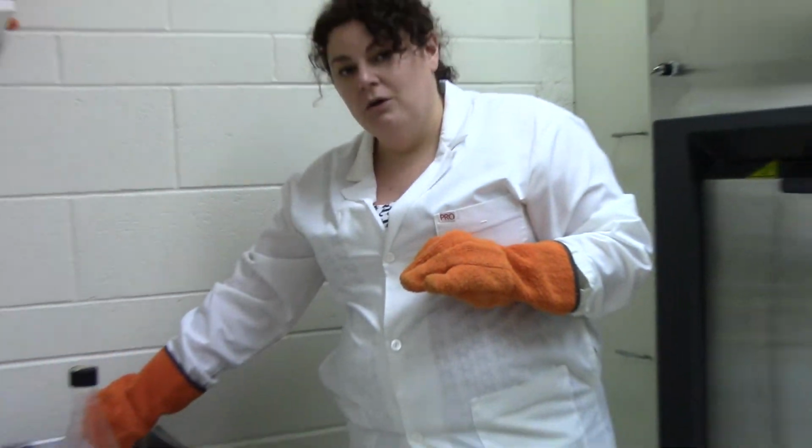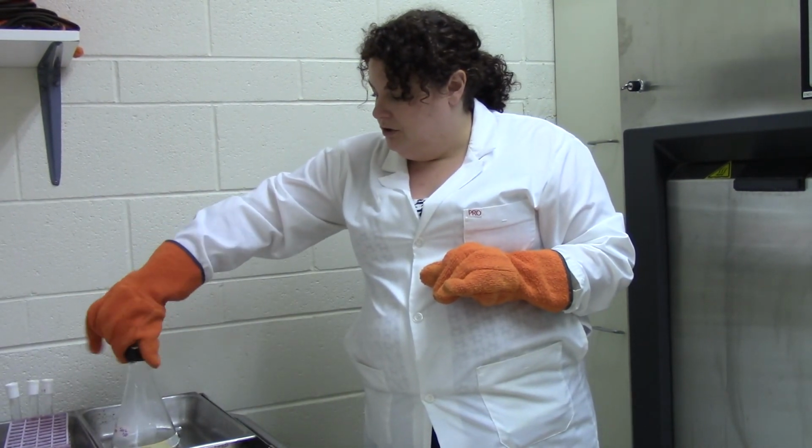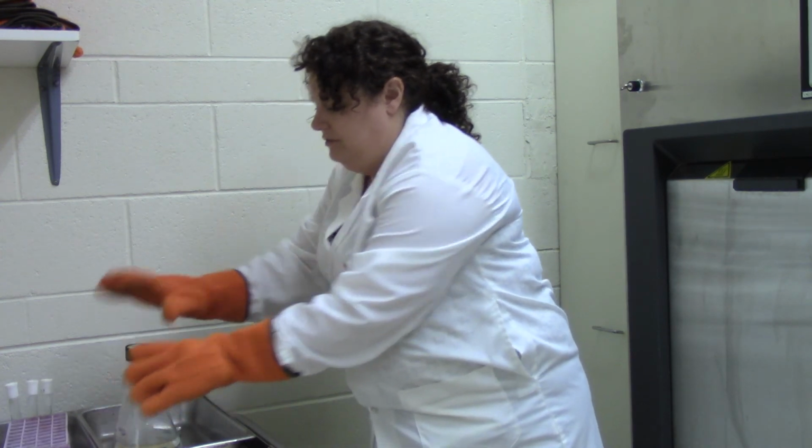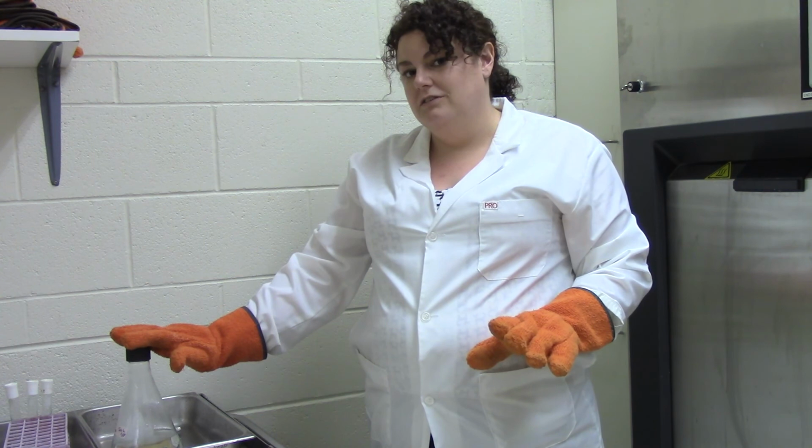And then the last thing I want to do before walking away is I just want to turn my lid and make sure that it's turned tight. That way we're keeping my contents sterile that are inside of the flask.